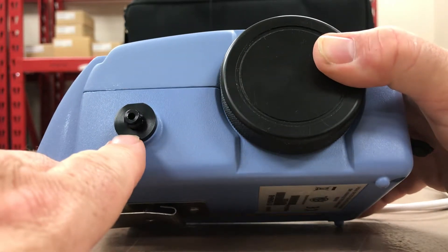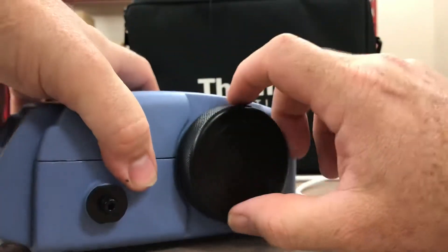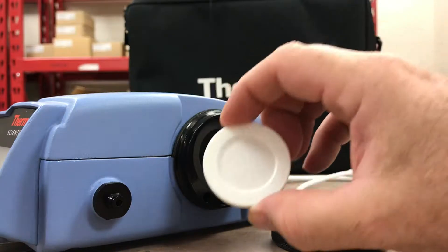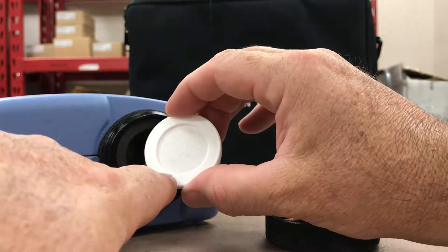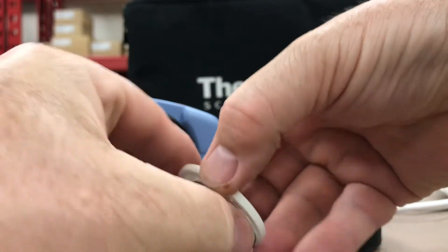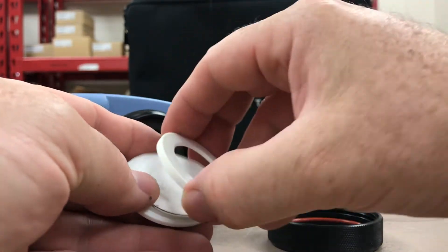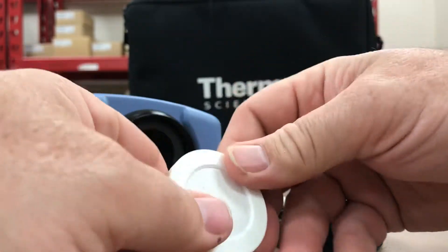Coming around the other side of this unit, this is the exhaust vent for the sample pump. On the side it has this big round black module — inside of here is an option to collect a sample onto a particulate filter for lab analysis. Much like they do with personal air samplers, it has a paper filter that particulate will collect on, and you send it away for lab analysis through the side here.